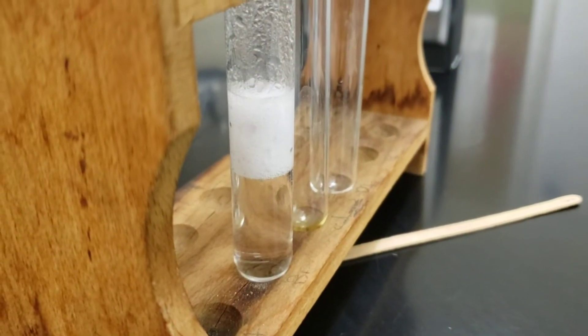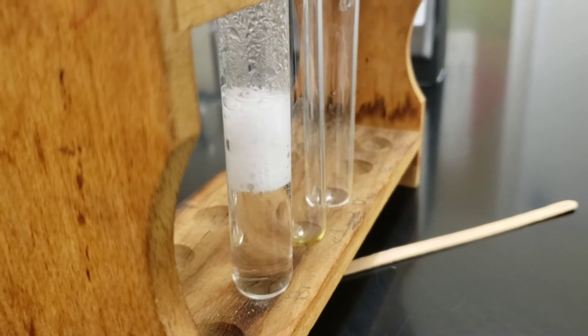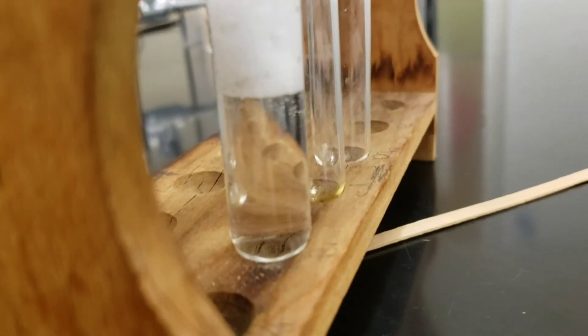As you can see from the second time that I did it, the bubbles will just continue as magnesium reacts, and it'll be that way for a few minutes.